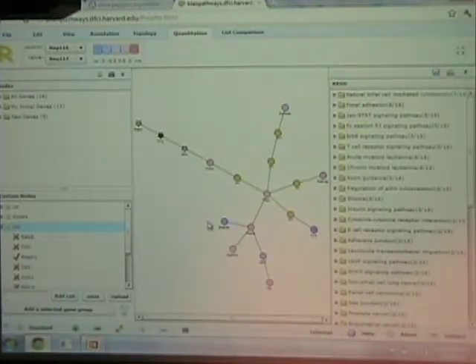I forgot to mention that earlier. So even what I just showed could be done in principle from a genomic perspective, because protein-protein interactions can be coded to the protein level. But I want to show you some aspects of the data that are truly mass spec and proteomics oriented.